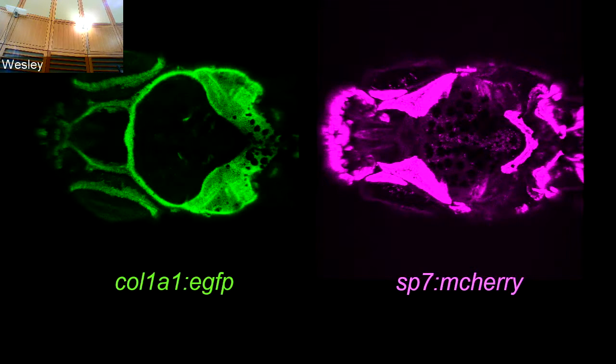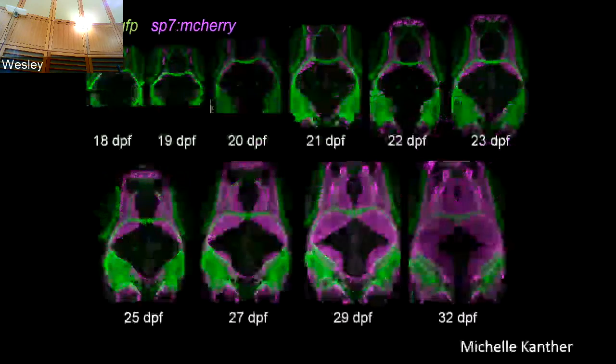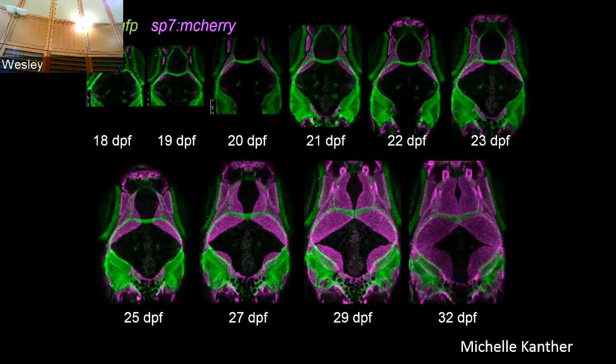And this is an example of some of the data that we've generated using these transgenic lines for some wild type fish. And I would urge you to go this afternoon to Alexandra Scully's poster. She will show you many more examples of beautiful imaging data, and also talk to you about the challenges and approaches that we have in imaging with live fish.